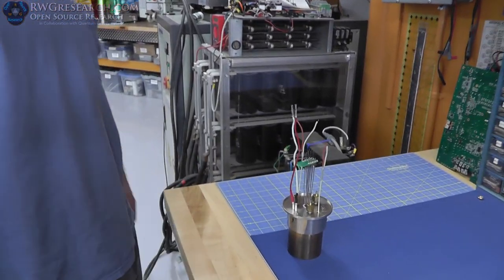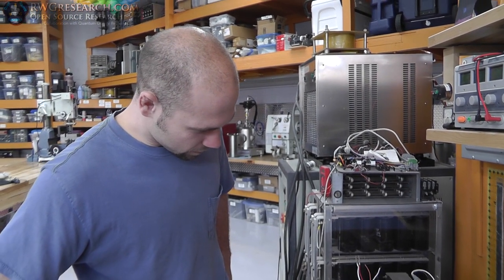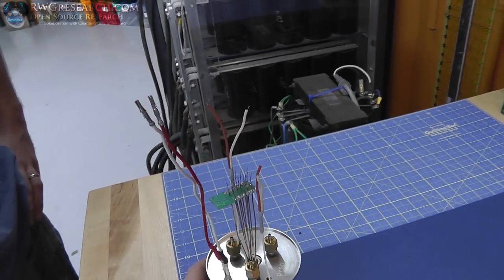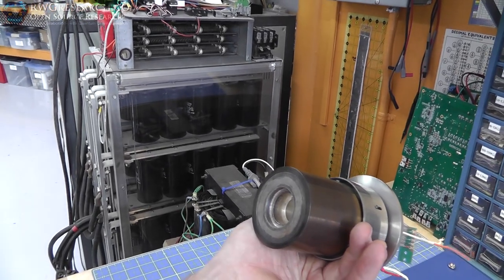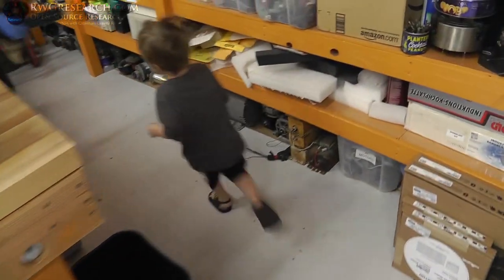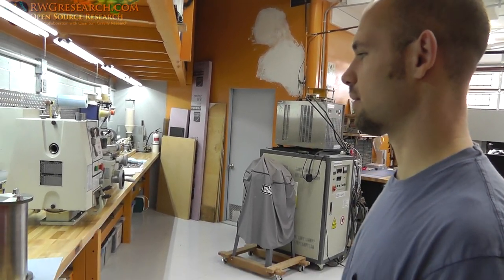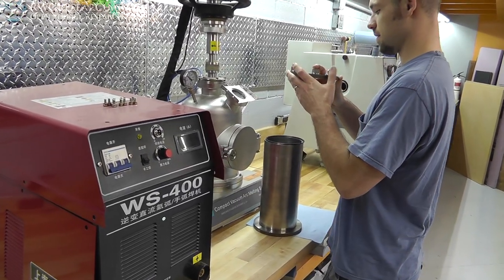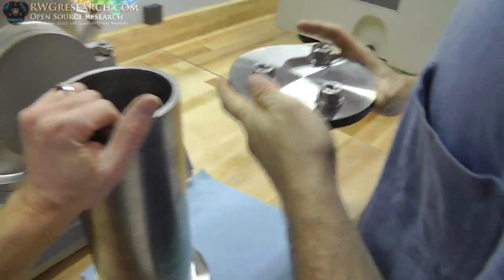Hello. Poking at this. You know what this is? It is a comparison calorimeter, but I don't know the proper... DSC. That's right. And it's just the head. Differential scanning calorimeter. Yeah. Careful. That's the chamber. You can lift the cap off. Wow, that's nice. So you already machined this, right? Yeah, that's super nice.